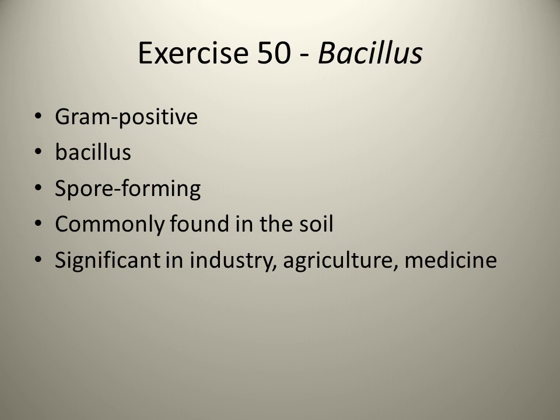Plate that soil out, incubate it, and then see if any of those spores do germinate. You could plate it onto just a nutrient agar, and then you can do a multitude of tests once you've had it incubate for 24 hours.